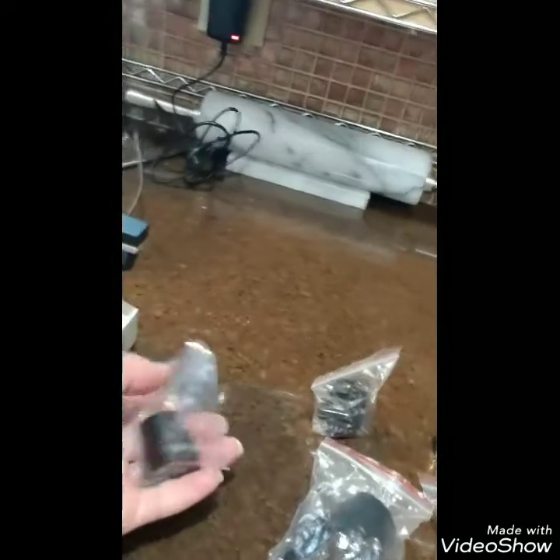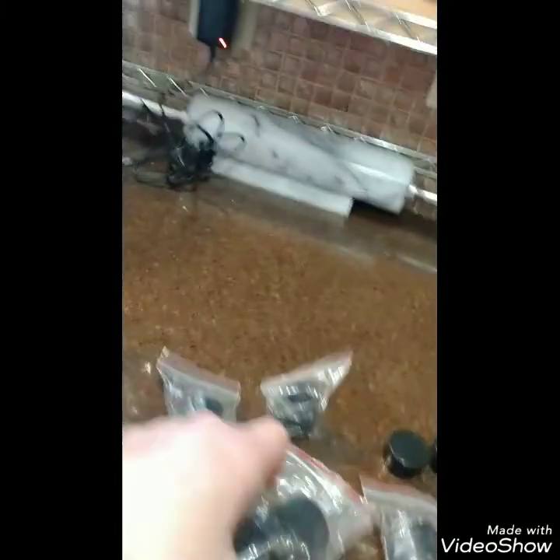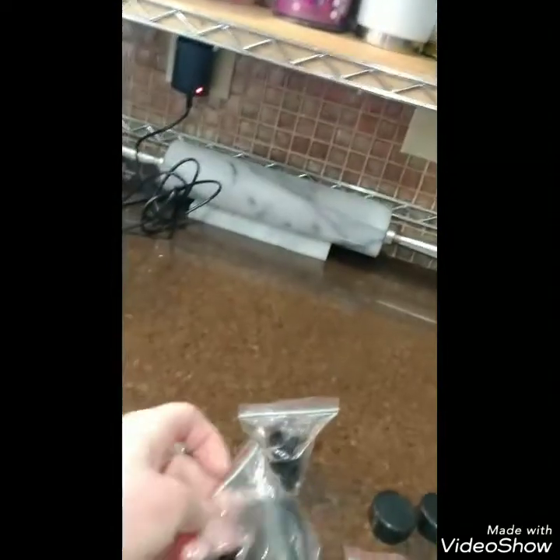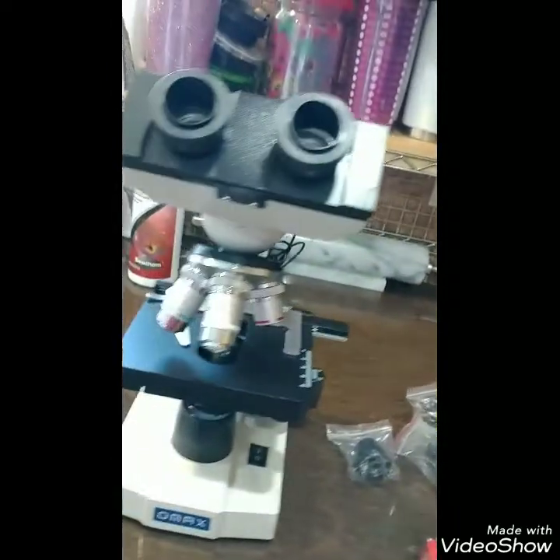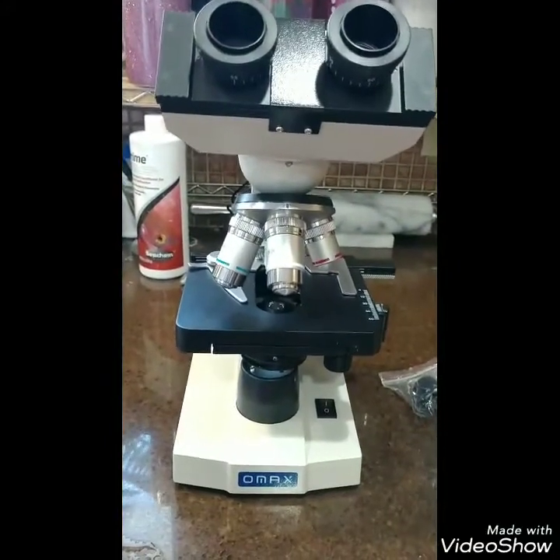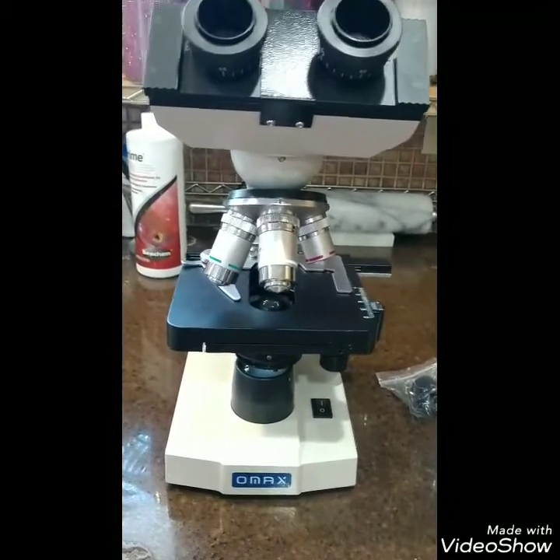Your scope is probably going to come with two different sizes for the eyepieces — the parts that you look through up top. For fecal samples, I use the larger sizes. Your scope probably will not come with any slides, slide covers, fecal solution, or test tubes, so you want to make sure that you get all those things.